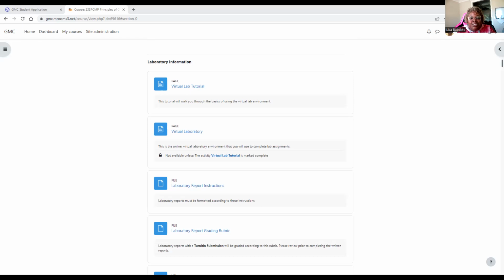Because that last digit could vary depending on who's making the measurement, we call that the uncertain digit, but it still is an important part of our measurement. And so we still want to write that. So we have 4.33 milliliters based on that. Or you could have written 4.30 if you didn't have that.